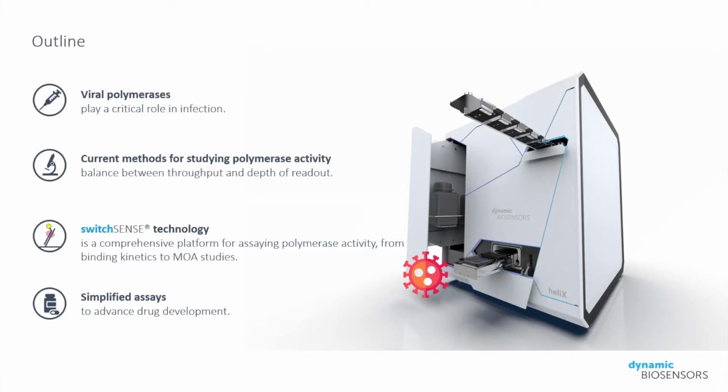To give you an outline of what we'll be talking about, we're going to go through viral polymerases and the role they play in RNA virus infection. We'll give an overview of current biochemical methods for studying polymerase activity and how they are preventing and limiting RNA-dependent RNA polymerase inhibitor discovery.